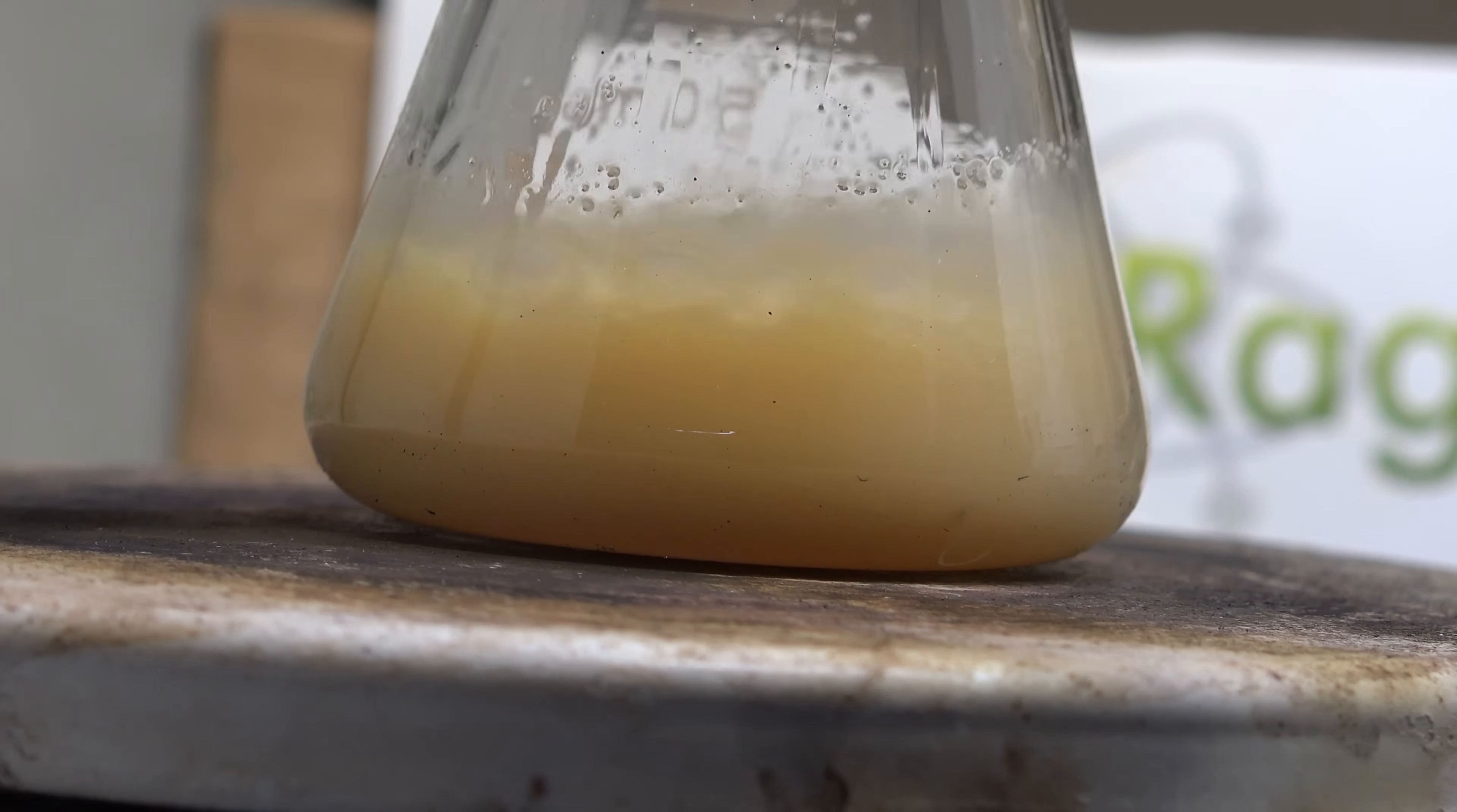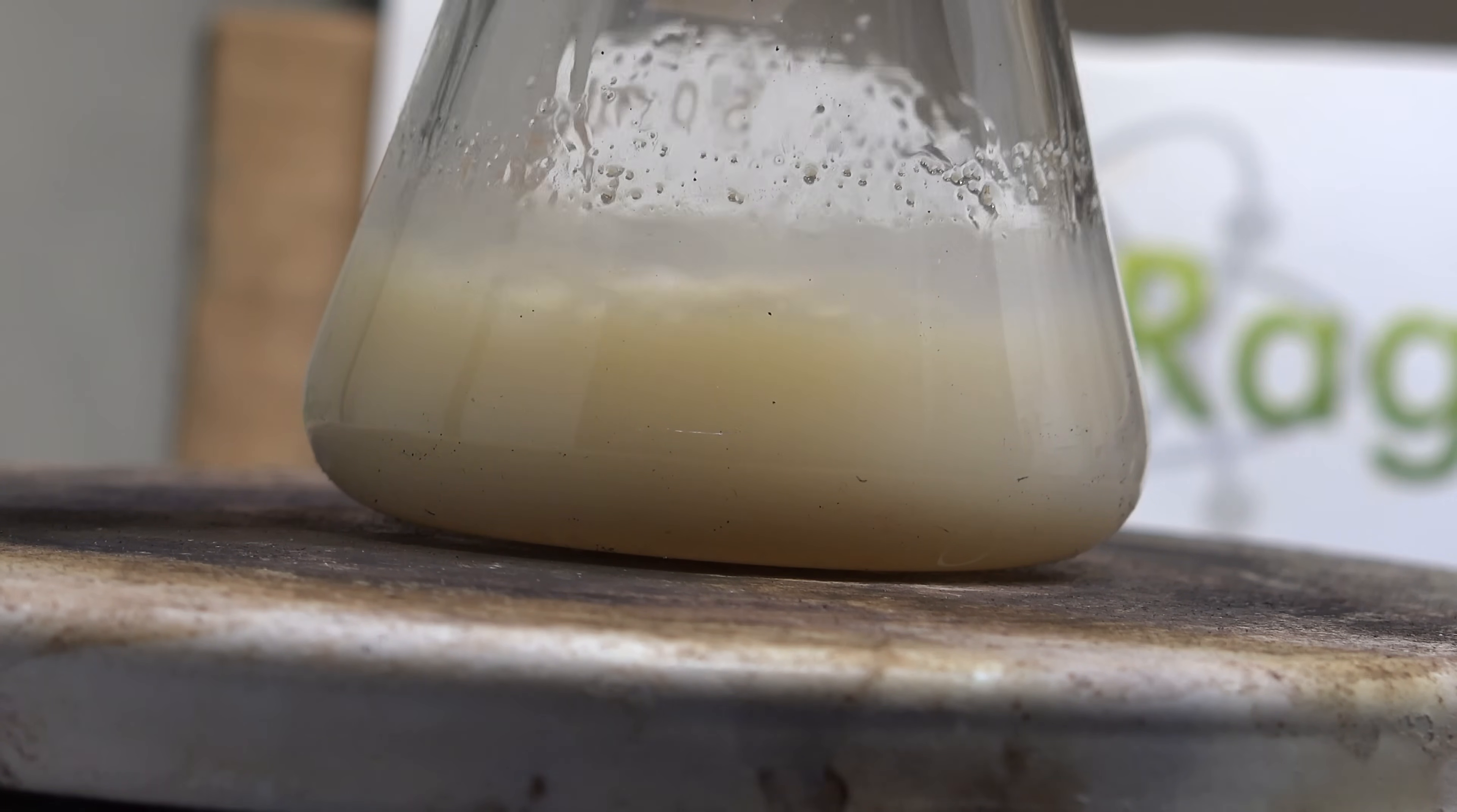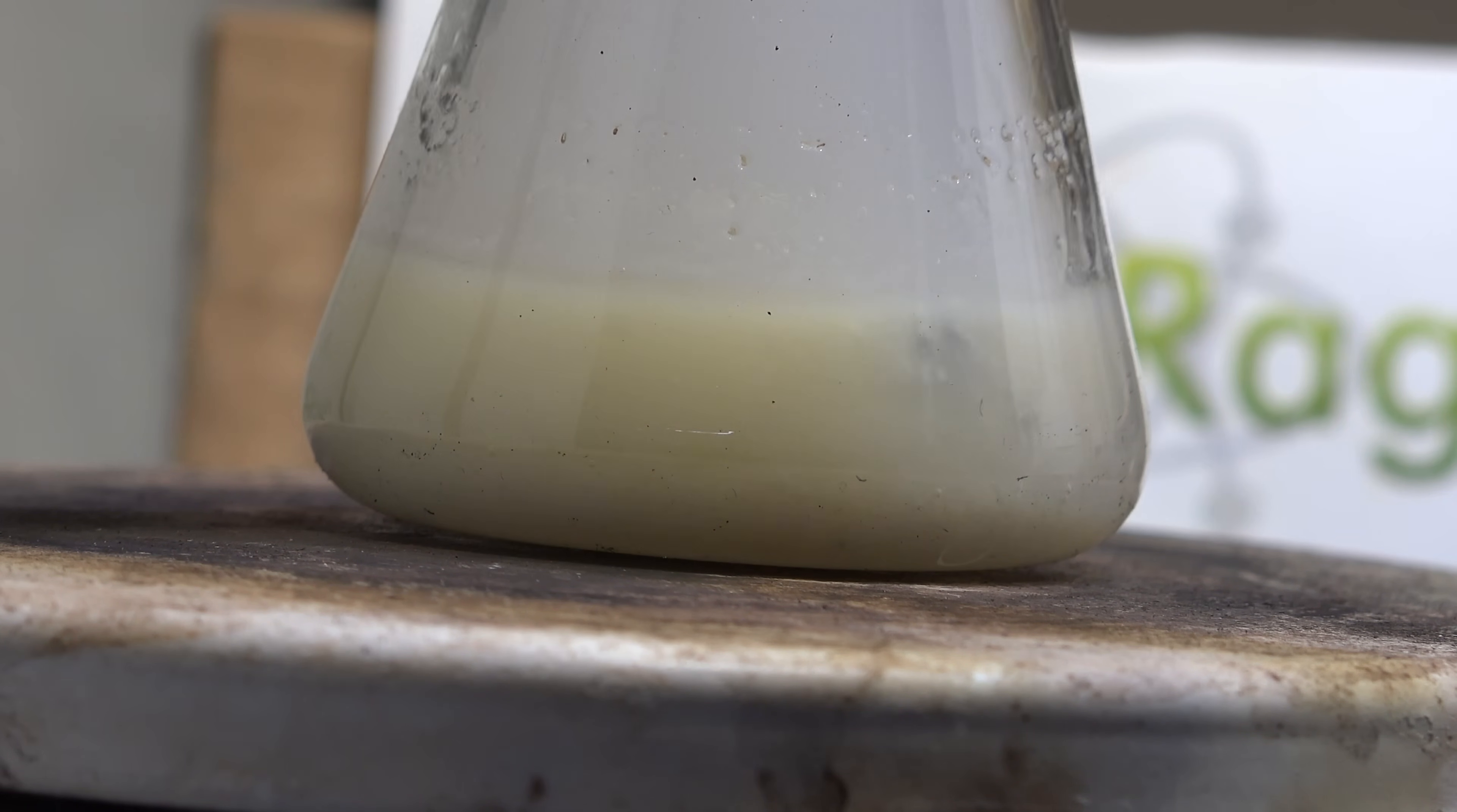Similar to testing if something is a fire hazard by setting it on fire. Setting it on fire isn't the point, it's to see if it can burn at all.